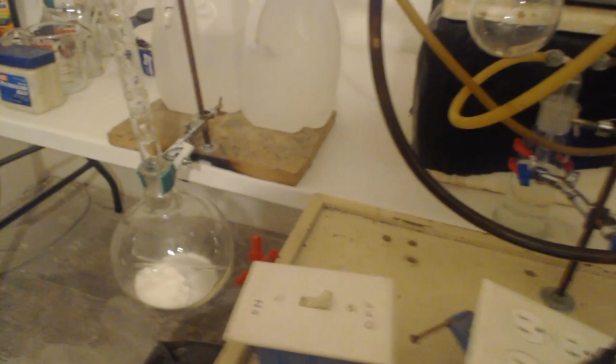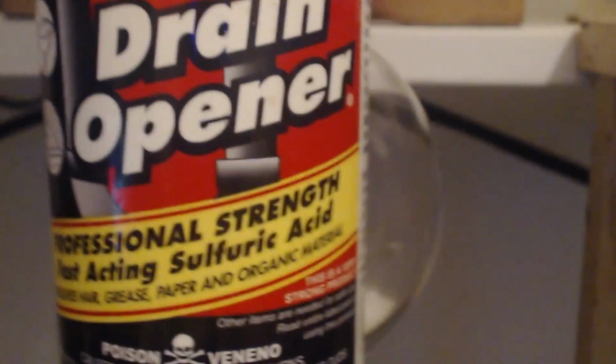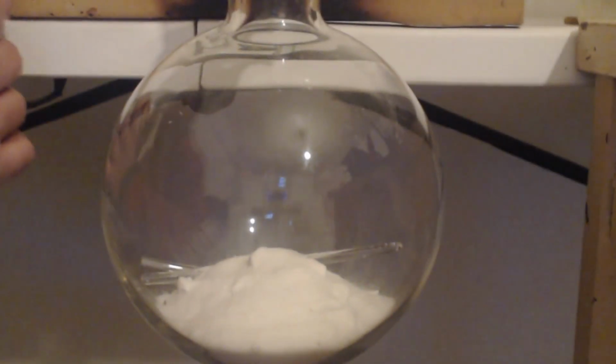There's a little bubbler there with some sodium hydroxide in it. I don't know if you can see it back there. Basically, when I add the sulfuric acid, it's going to react and make nitric acid, and I'm just going to distill it out. That's it. So I'm just going to add about 170 milliliters, 168 milliliters of this acid here, drain cleaner.